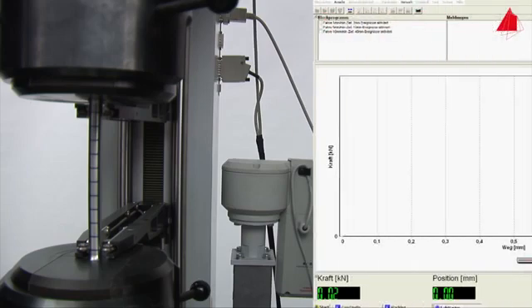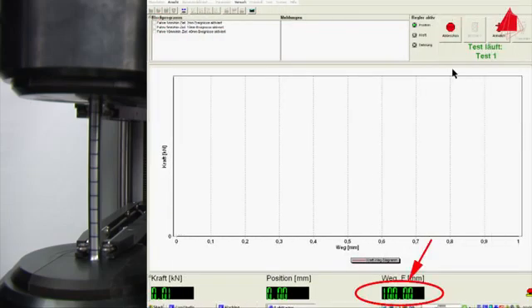The gauge length is displayed at the bottom right hand corner of the screen. At the beginning, it amounts to 100 millimeters.